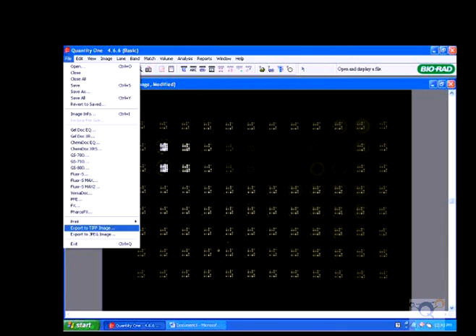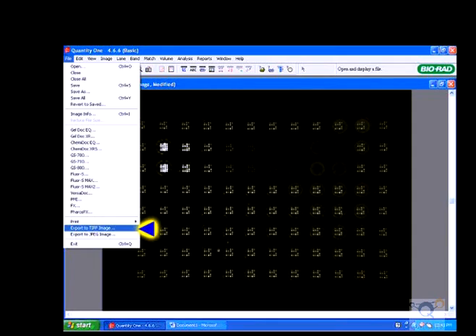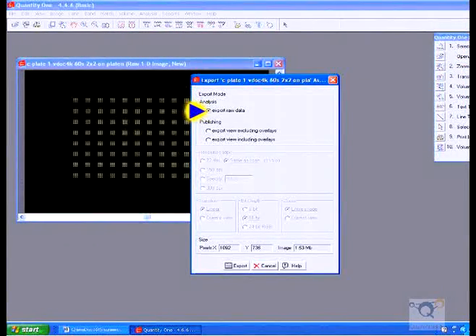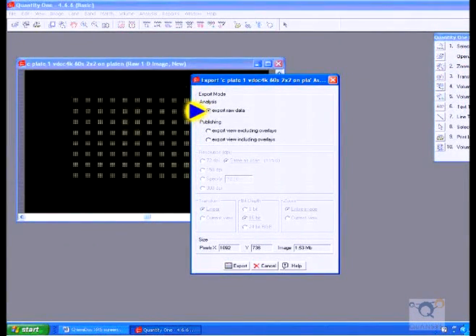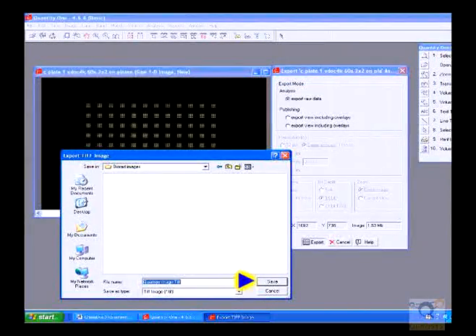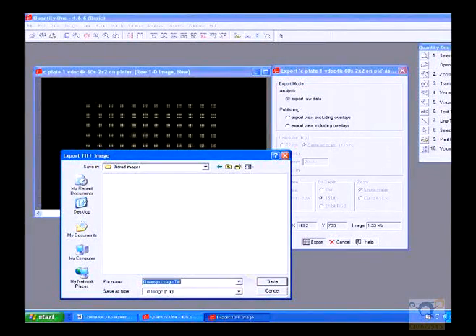After acquiring the images, you need to convert them to TIFF files for analysis. Click on File, then Export to TIFF Image. Select Export Raw Data. Click on Export. Then click on Save.